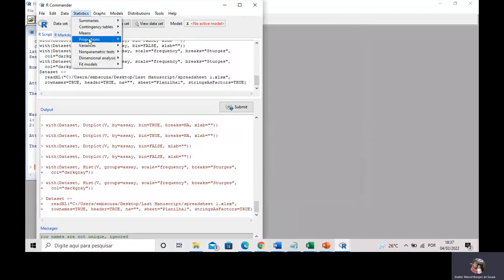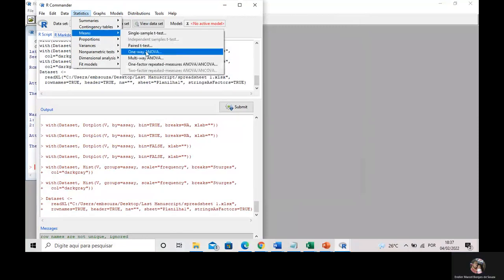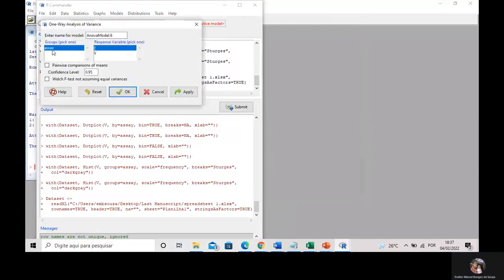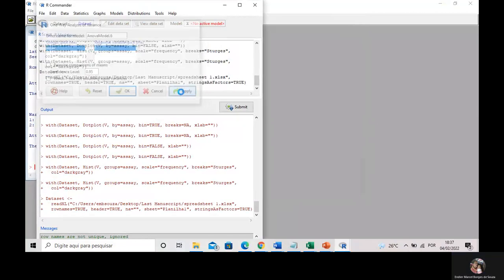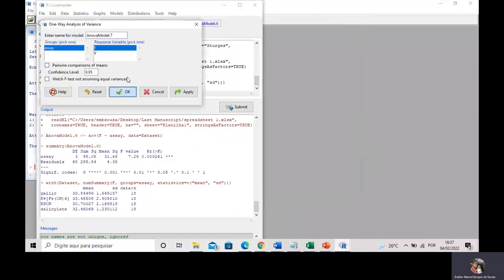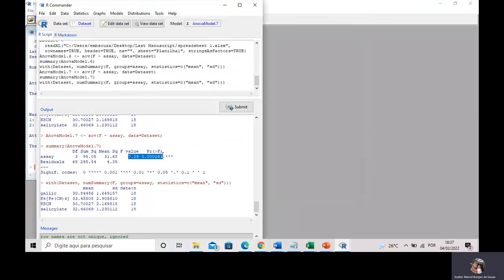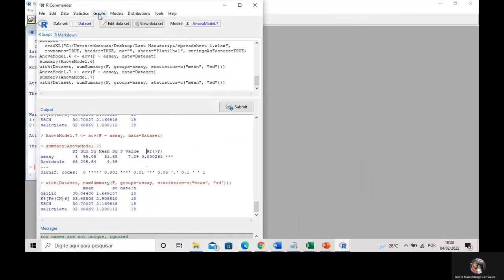To run a one-way ANOVA for iron mass in dietary supplement F, I click Apply. I get the same result as in Microsoft Excel — here is the F value and here is the P value, which shows that my data are not equivalent. I have equivalent values when the P value is above 0.05.